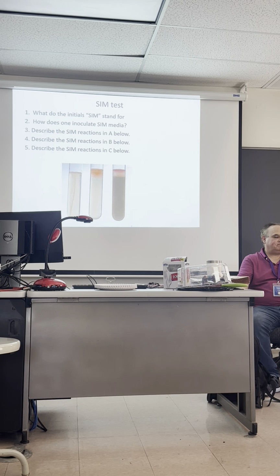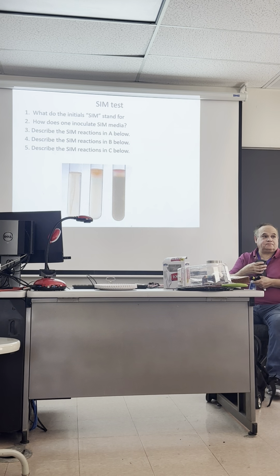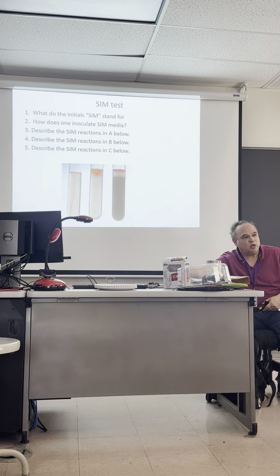Okay? Good? This is the way it's gonna work. For instance, for the middle test tube, would you say on the practical that it is fuzzy or it is turbid? I said it was fuzzy, and you just missed it.